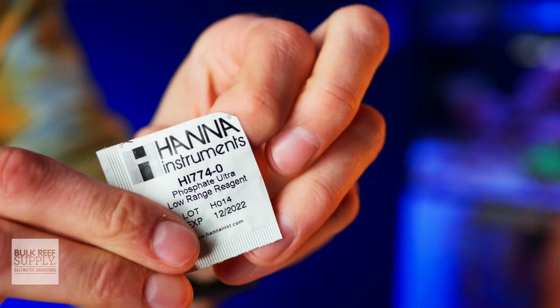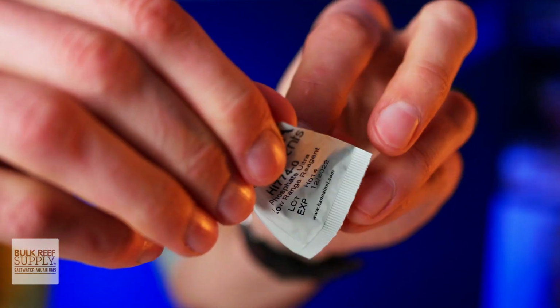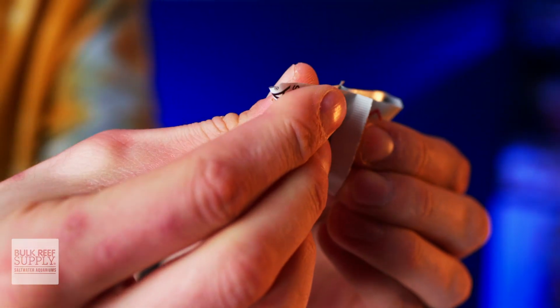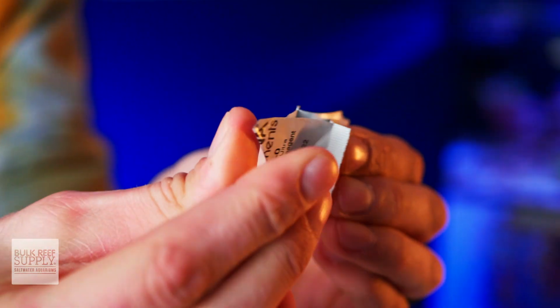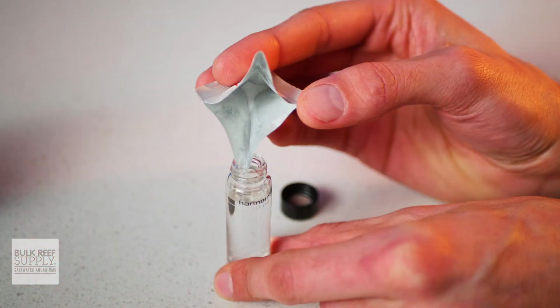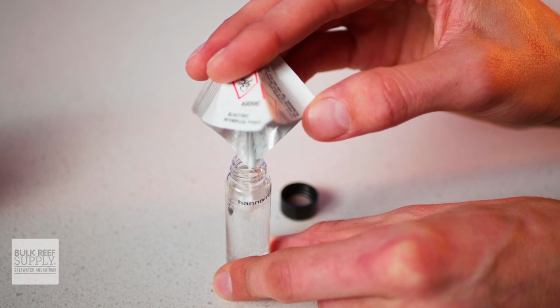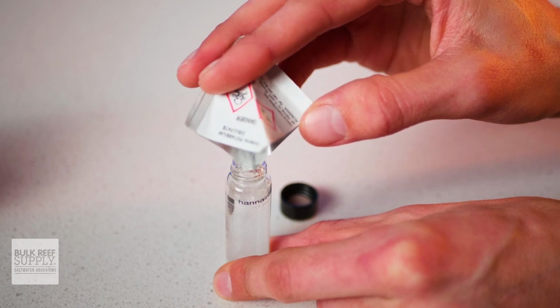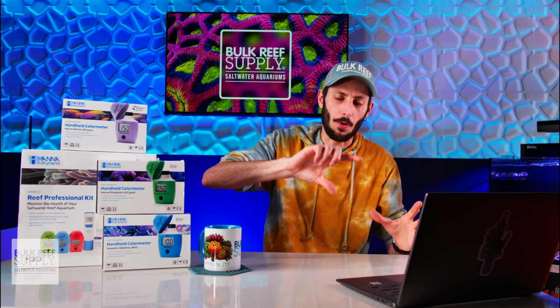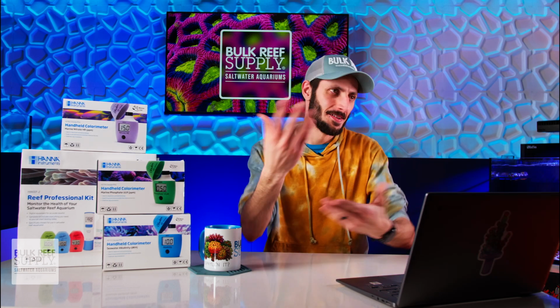After that, push on the corners of the packet to open it up so it creates a pocket. Spread the pocket apart until it's flat in the opposite direction, creating a nice crease down the center of the packet. This creates a little funnel for the powder to slide down, and you can place the tip of that funnel on the edge of the vial, tip it up to send all that reagent powder down into the vial, a couple of taps, and you're done. Okay, not done. You still gotta put the cap on and then invert the vial a bunch of times and then put it back into the checker to actually get a reading, but you know what I mean.